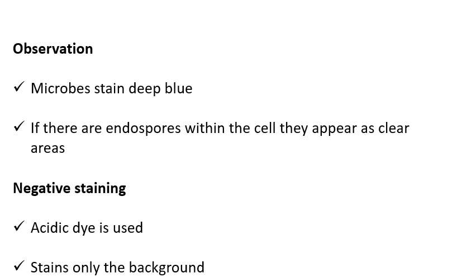When you observe under the microscope, microbes stain deep blue when you are using methylene blue. Microbes will appear blue in color. If there are endospores within the cell, they appear as clear areas.